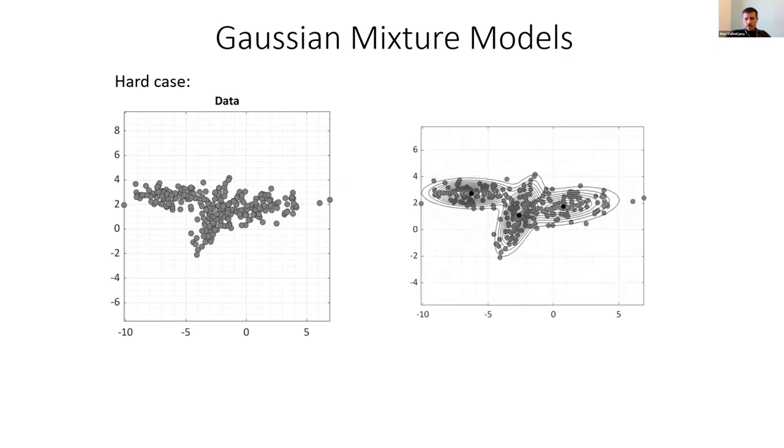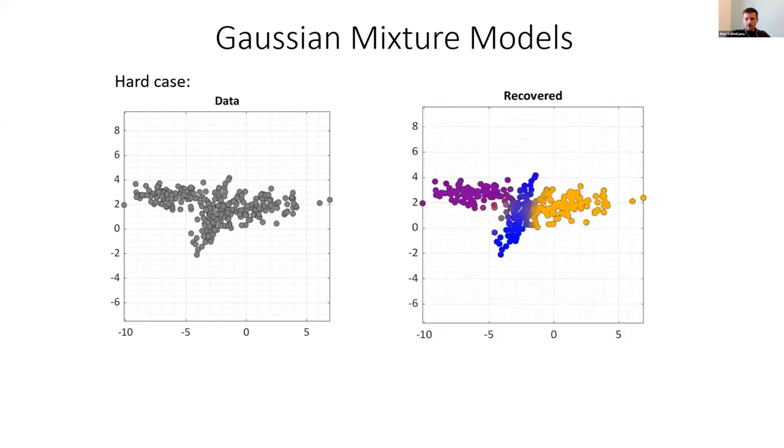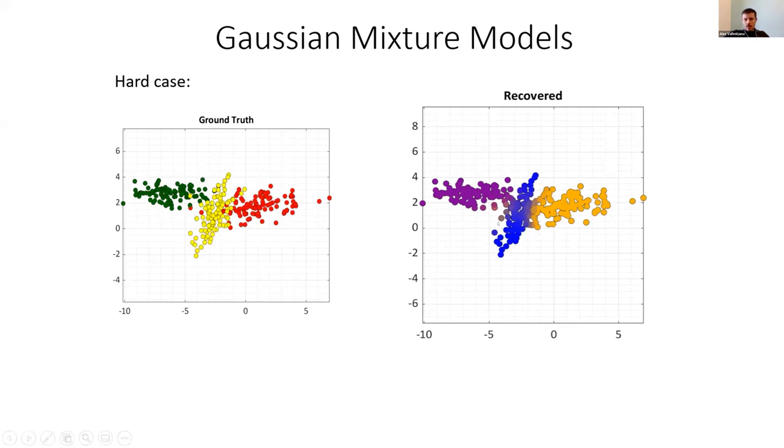Here's a hard case like the ones I was showing before. And as you can see, it still models the data pretty well, to the point that the system can tell when the data is mixed up. For example, the two red points on the left side that are beyond the middle cluster are still assigned some probability of belonging to the rightmost cluster.